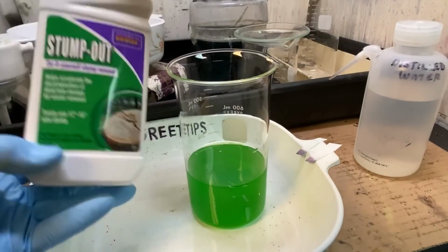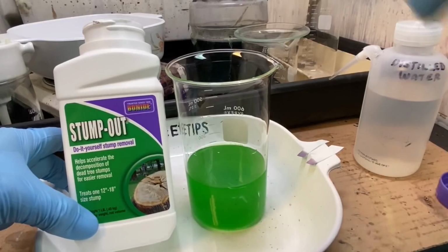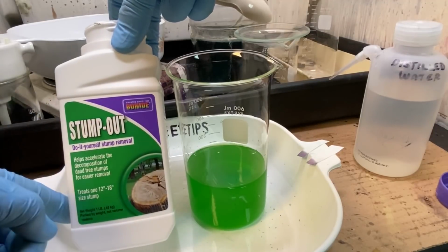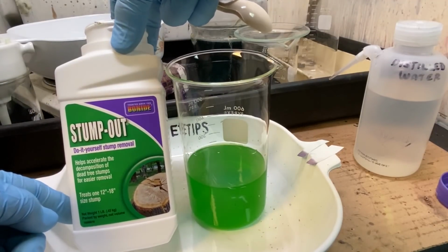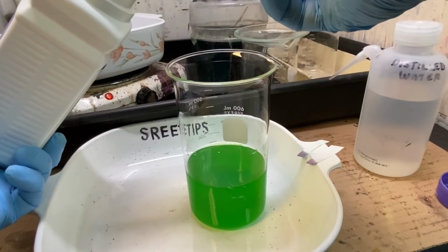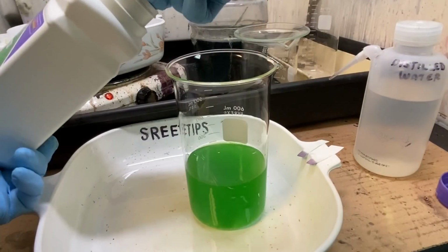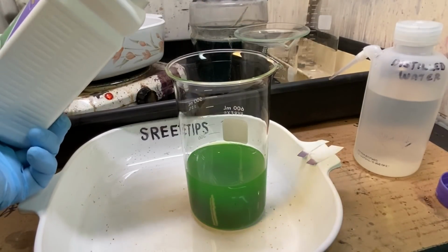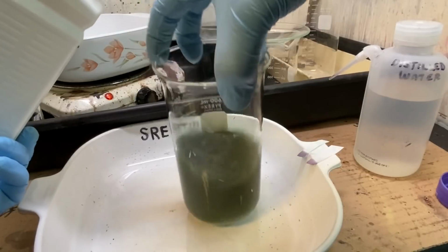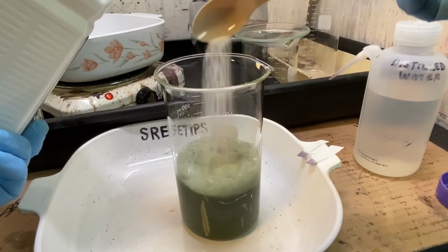Precipitation with stump out. This is from Ace Hardware. It's a stump remover by Bonide. Just remember the green and purple container. The stuff from Spectracide won't work. All right, we're going to add some spoons of stump out now to our gold solution, precipitating pure gold. Here we go.